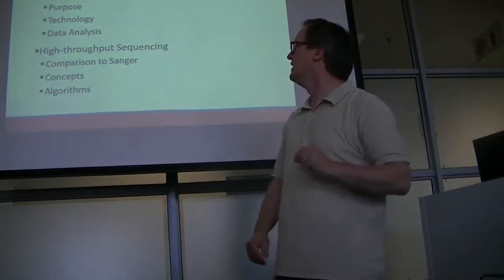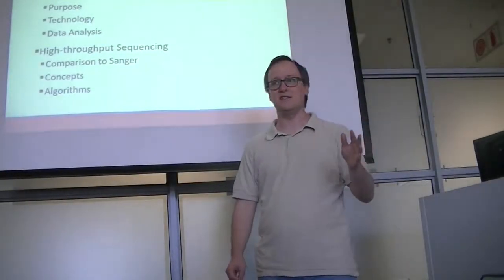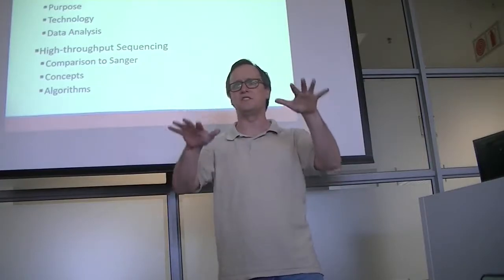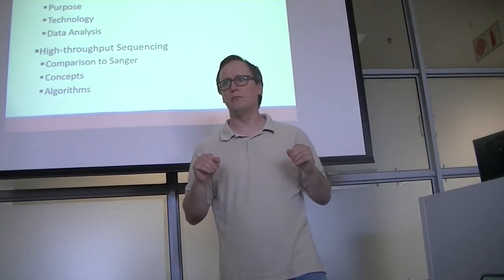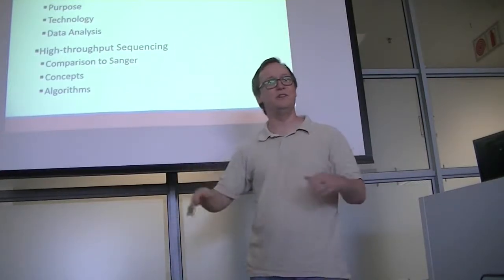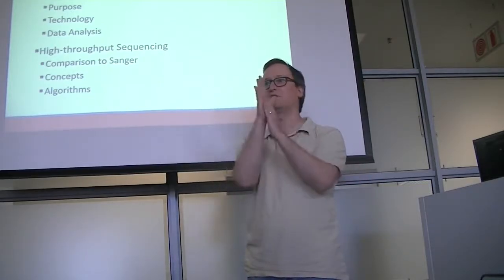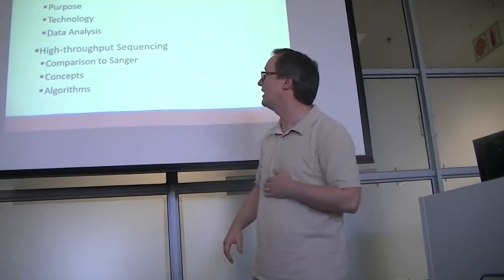We're going to be talking about the biotechnology of gene expression via microarrays, yes, but also via RNA Seq. Does everyone know the distinction between microarray and RNA Seq expression? Oh, okay, well we'll cover some of that. One is a technique of hybridization of probe sequences on a physical surface with bits of cDNA, and the other one is a sequencing exercise.